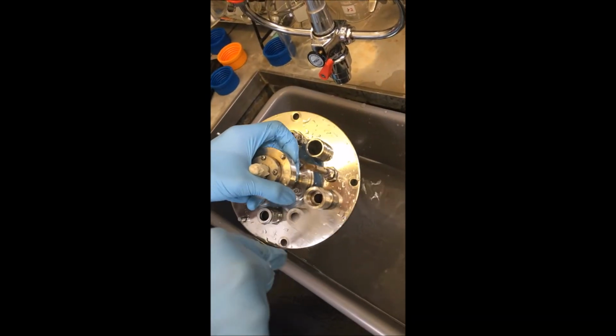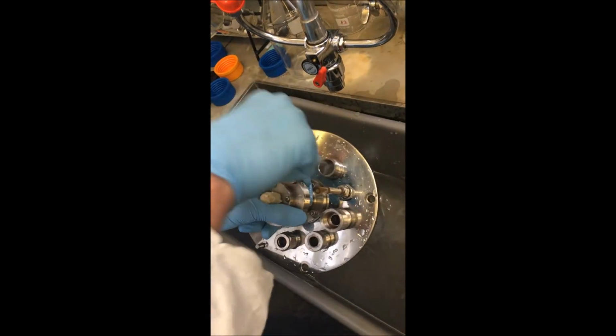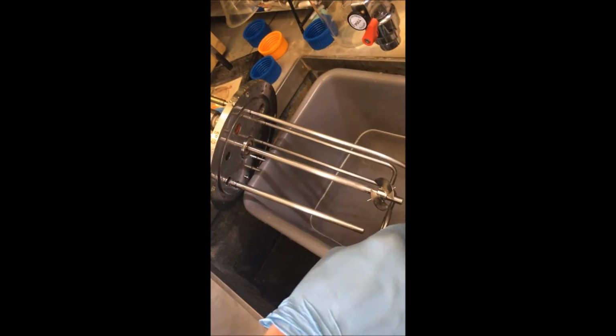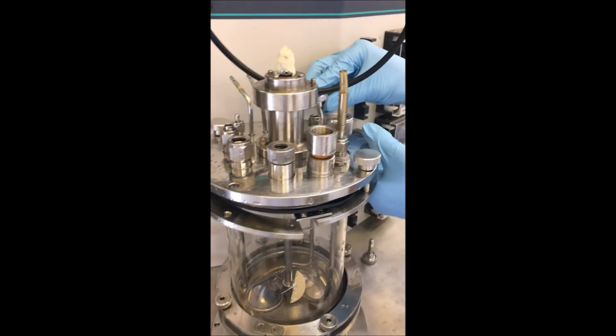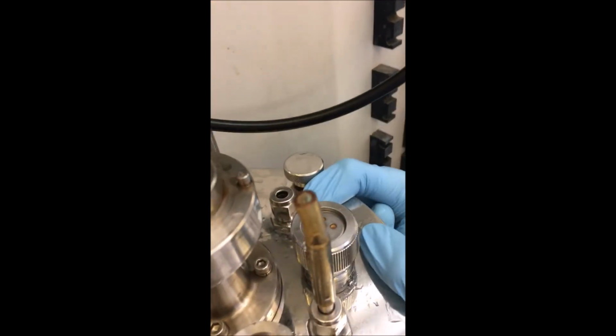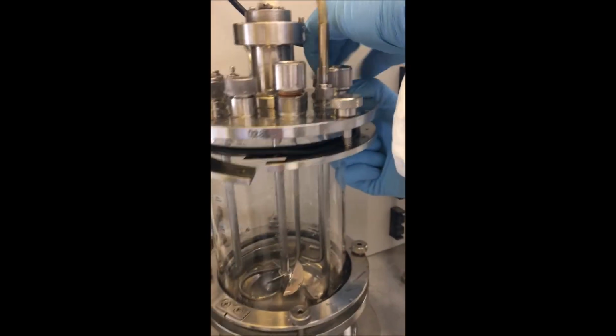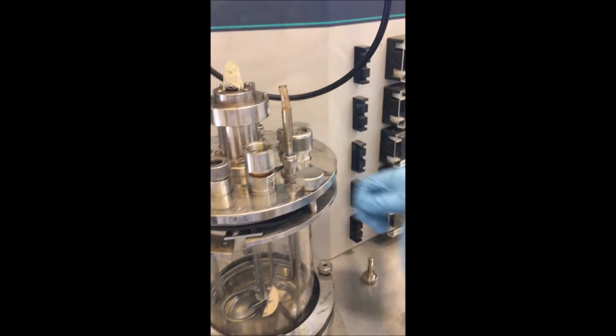To avoid contamination, the bioreactor and all glassware were cleaned thoroughly with soap and water. To ensure that all the equipment was sterilized, the bioreactor, TSB media, and all glassware were autoclaved at 120 degrees Celsius. We made 3 liters of TSB media at a ratio of 30 grams per liter of distilled water.